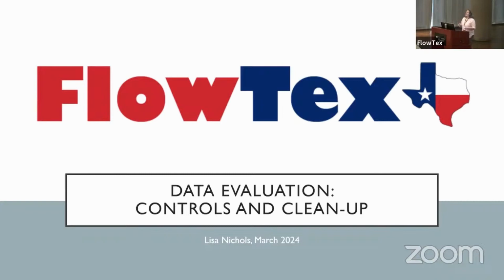So this is a lot of time to spend on one assay. And as we've seen today, there's really a lot of very detailed information that's gotten in there. So I'm actually not going to tell you anything new in this particular talk. What I am going to do is hopefully put it all together in a little bit of a workflow and see how all these pieces fit together and what are some of the nuts and bolts things we need to do to get our experiments done. So let's go ahead and start off. We're going to talk about data evaluations, controls, and cleanup.